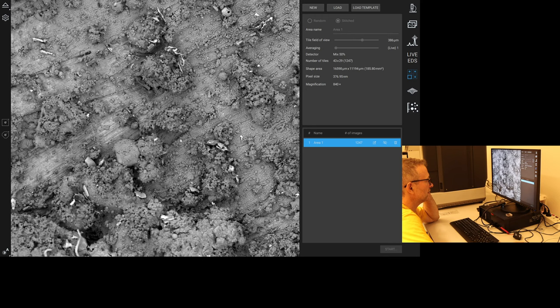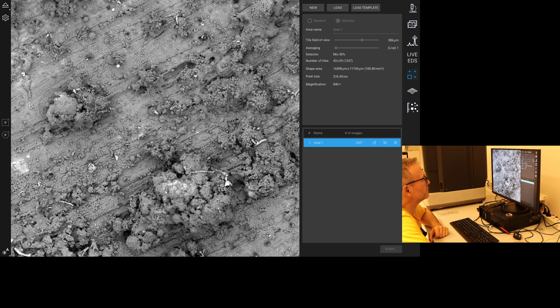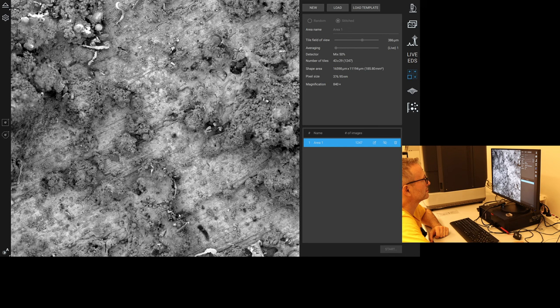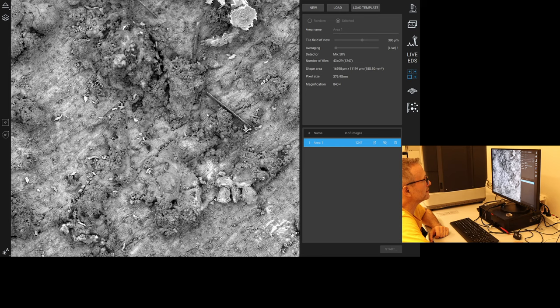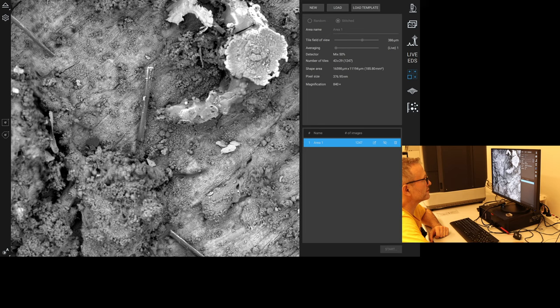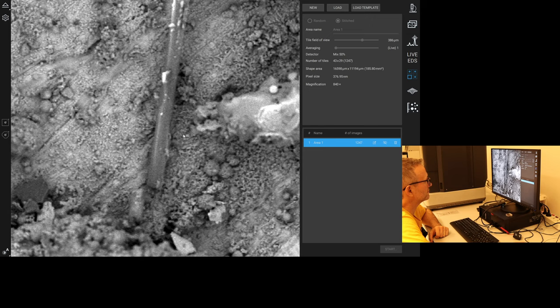So this is on what's called a dynamic zoom image, DZI. And I will give access to the PC software that allows you to zoom around these images. That looks like a nice piece of rod there. And that one, there's another one of these kind of fluorescent things here. Interesting. It's very, very regular, aren't they, these things? That's slightly narrower.